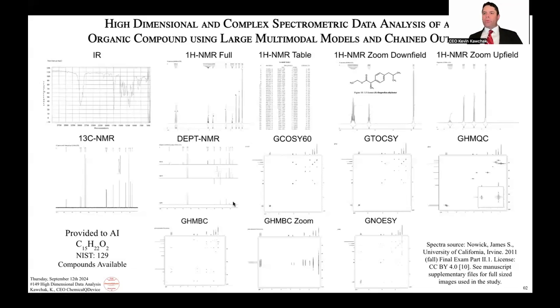And obviously those are methyls because they're so upfield anyway. And I saw this effect with the dimethyl off the isopropyl in other types of spectra too, with some bleeding, especially with NOESY, basically spatial interactions. So GHMQC and GHMBC, these are proton to carbon, GHMQC being shorter range and GHMBC being longer range.